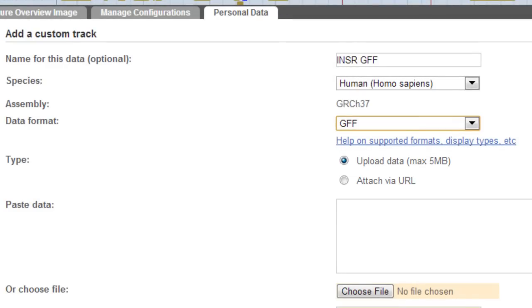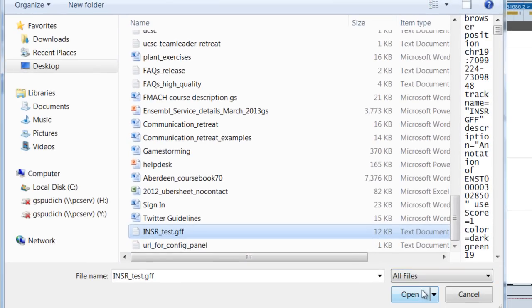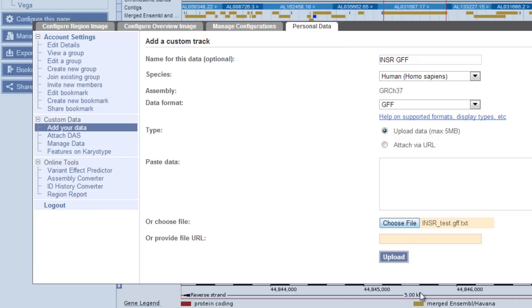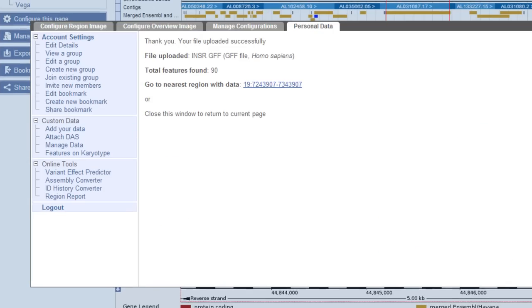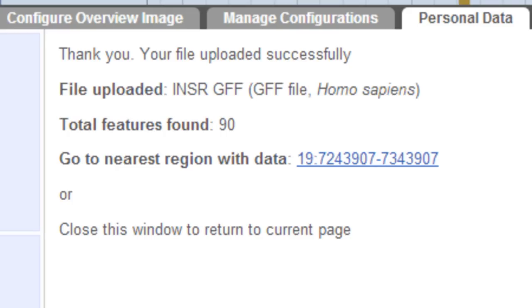I'll leave it on upload. I'm going to upload my file by choosing a file, but you could also paste the data directly in the box. Click Upload — it worked! I'll follow the link to the nearest region with data, which is on chromosome 19.